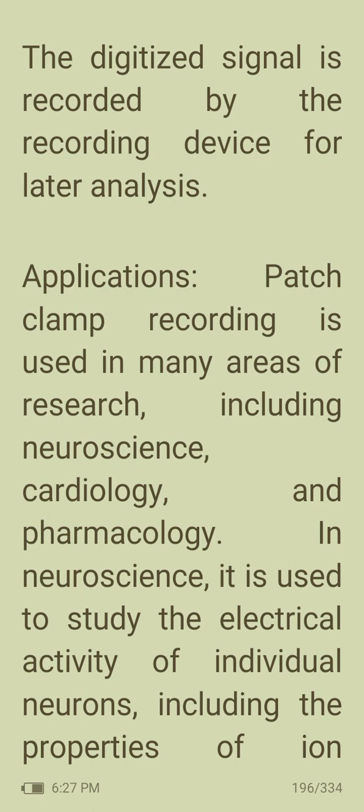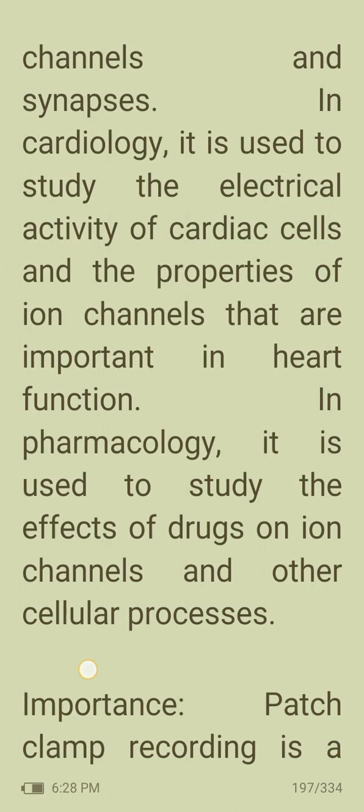So what is the application of patch clamp recording? Patch clamp recording is used in many areas of research, including neuroscience, cardiology, and pharmacology. In neuroscience, it is used to study the electrical activity of individual neurons, including the properties of ion channels and synapses.